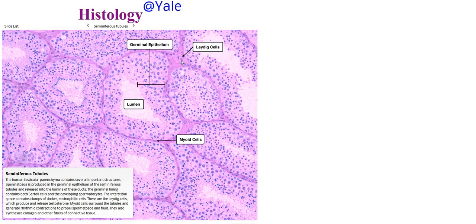We have a couple other types. We will find Sertoli cells. Those are going to be scattered kind of within this epithelium here. Another name for the Sertoli cell is nurse cell. So these are going to be nursing or nourishing sperm cells during that production process. We're not going to pick out individual nurse cells on this slide, but I want you to recognize we would find them in this epithelial layer.